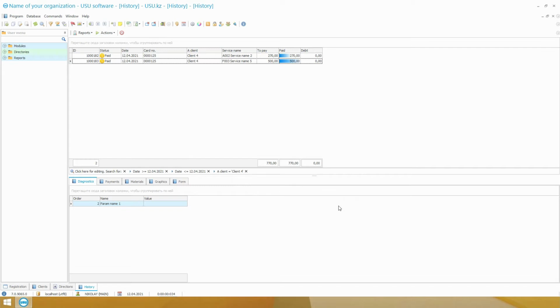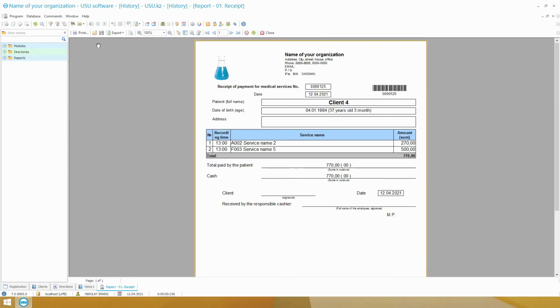As you can see, the action of accepting payment is signed as number 1. This is the first thing to do when you start working with a patient order. There is also a number 1 priority for the reporting documentation, the issuance of the payment receipt. You print it out after receiving the payment. The receipt will be printed with the logo and requisite details of your organization. An important point is the presence of a barcode in the corner of the receipt. It is needed at the next stage at the biomaterial drawing point.